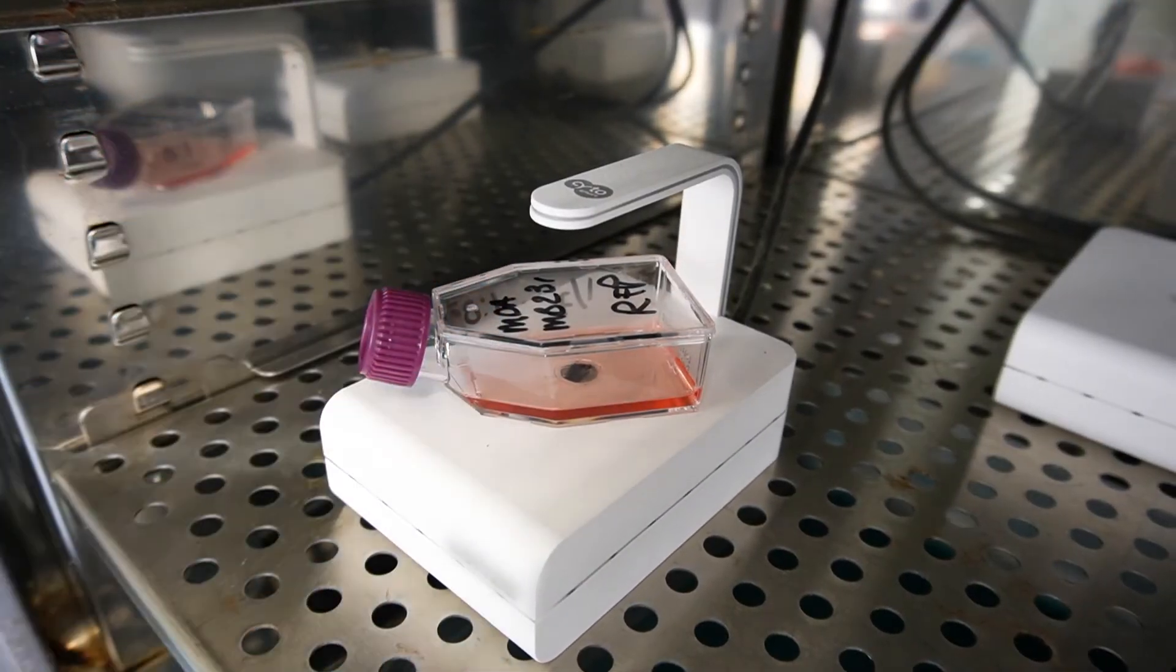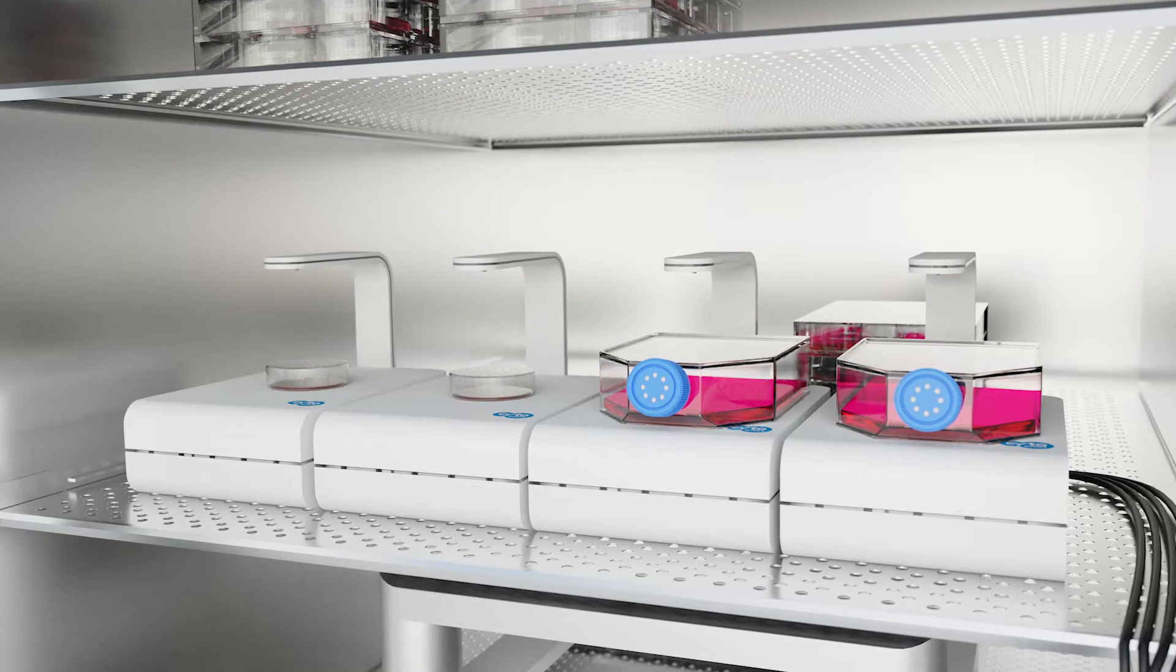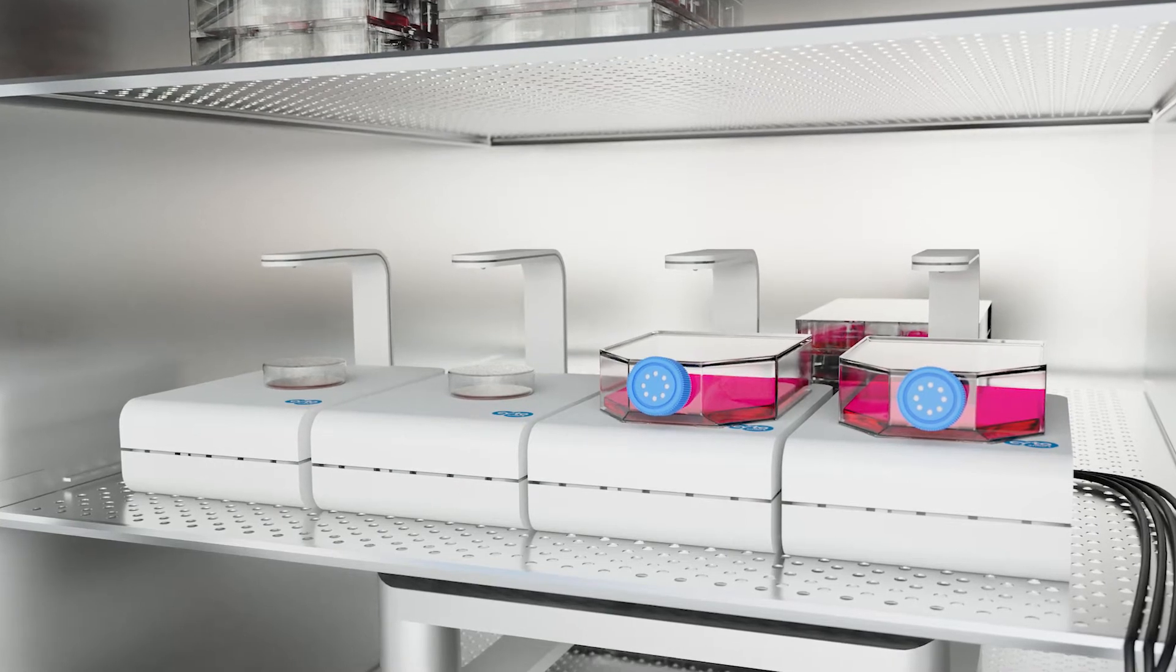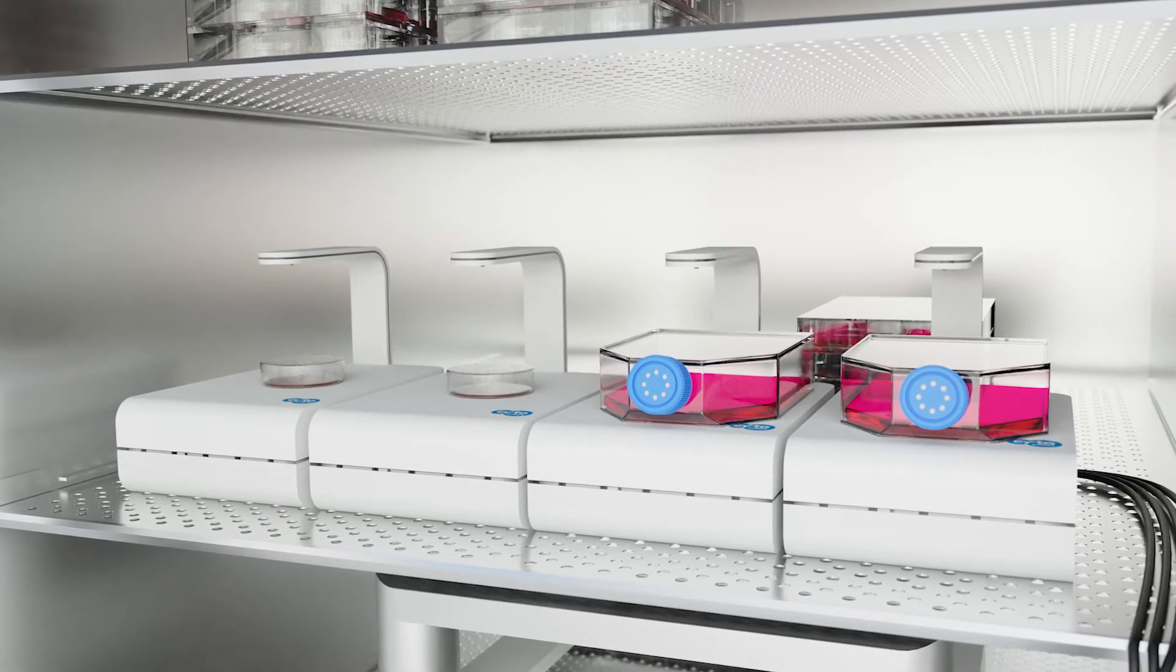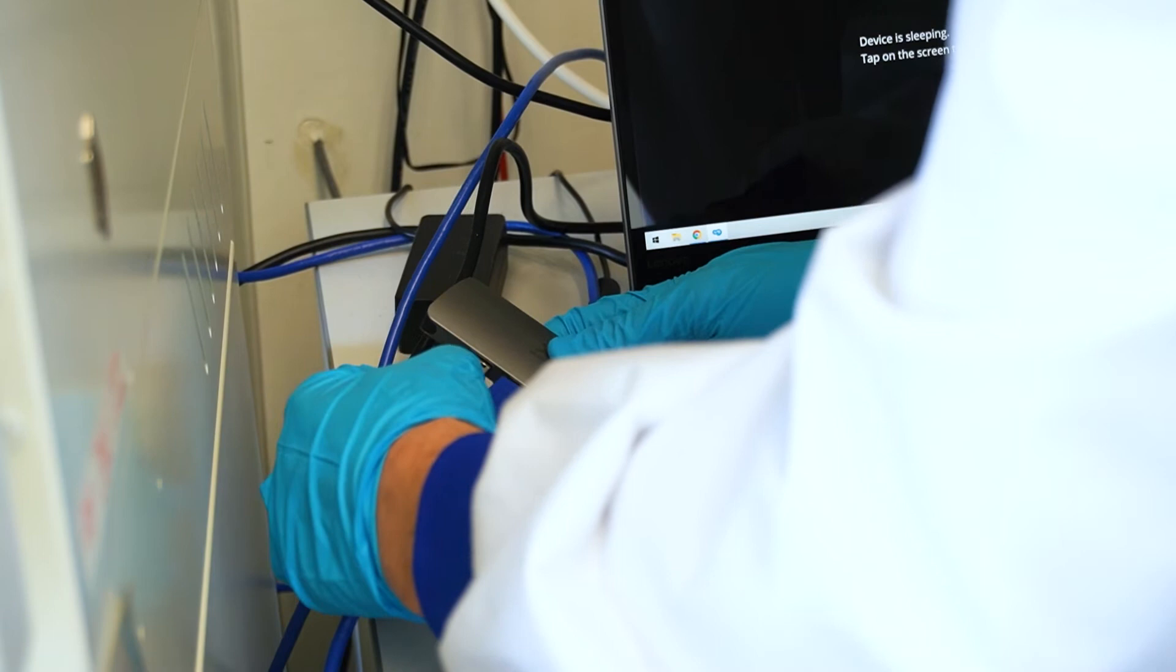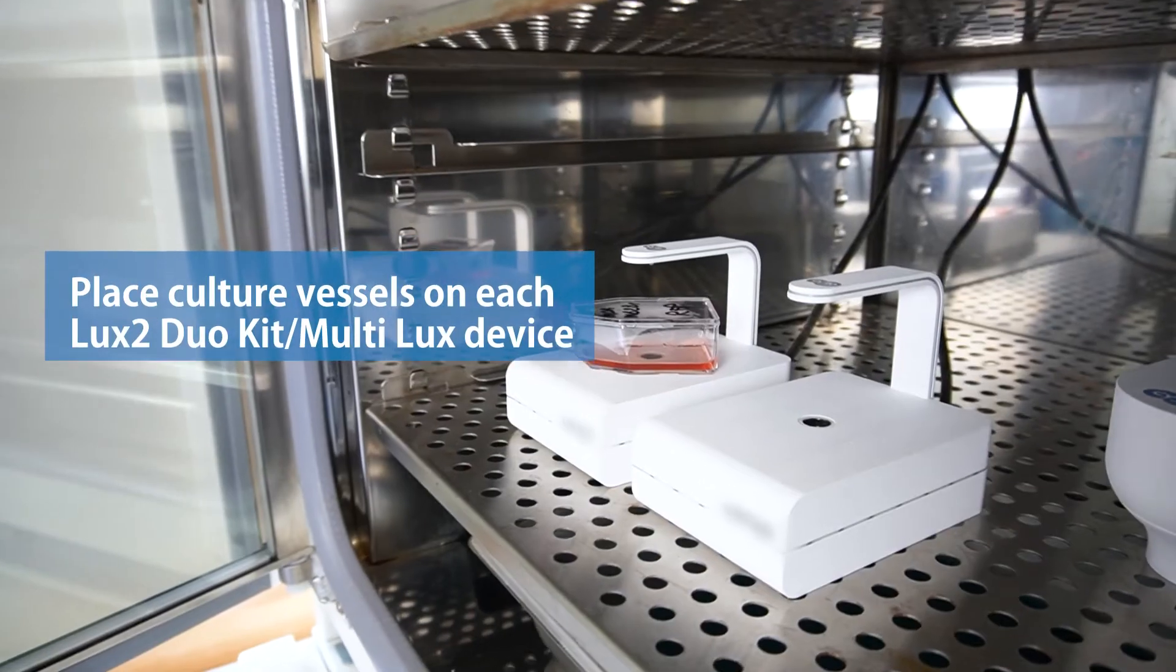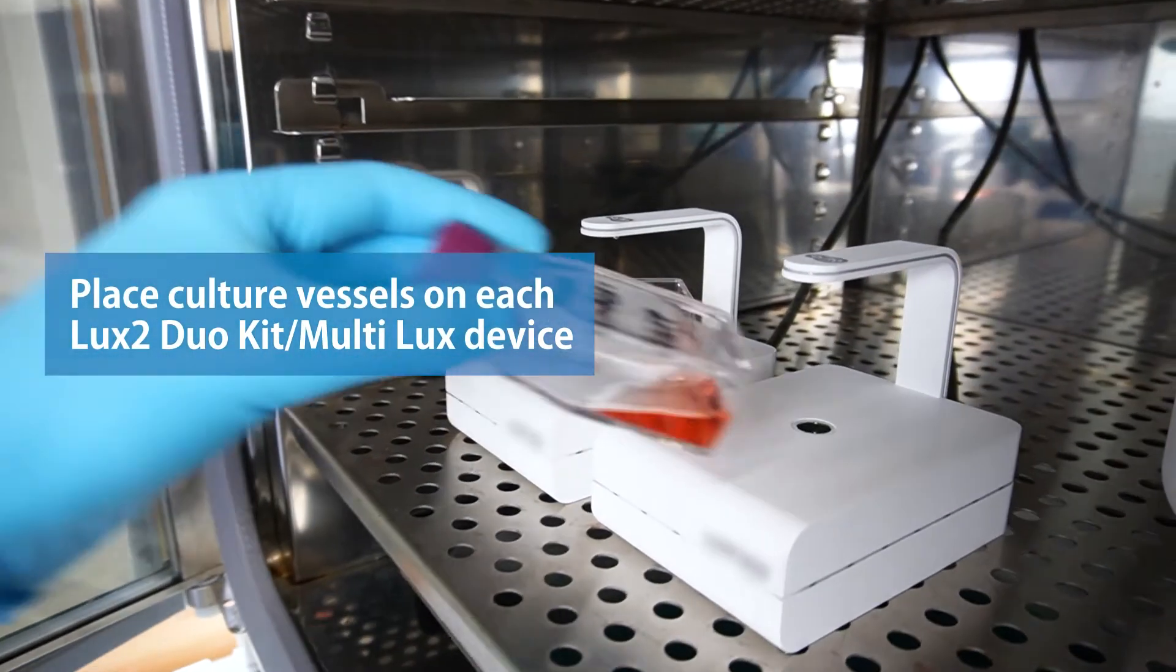With the Lux2 Duo Kit or Multilux, you can image multiple cultures simultaneously. Simply connect multiple devices to the same laptop and place a culture vessel on each device.